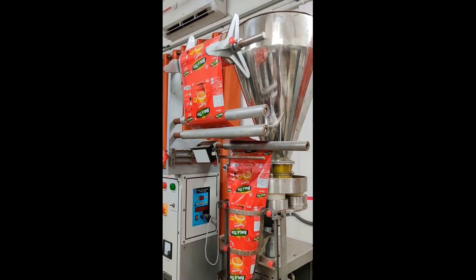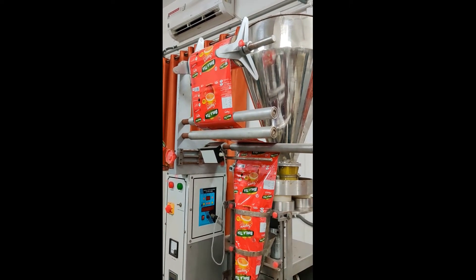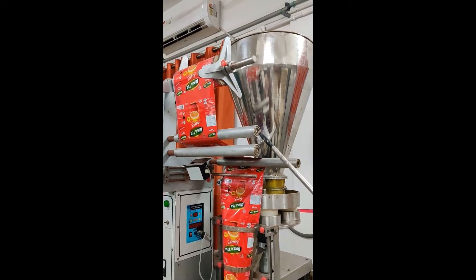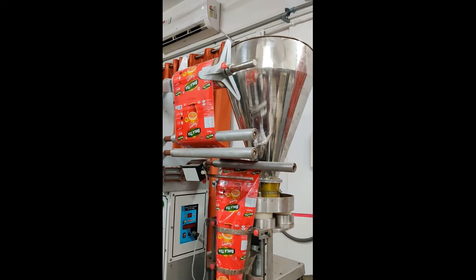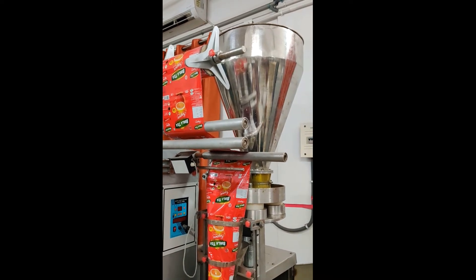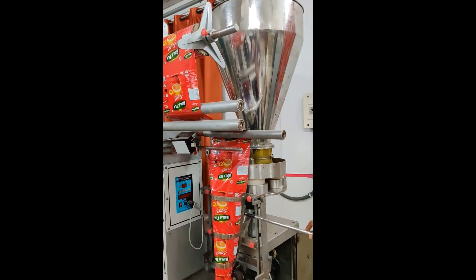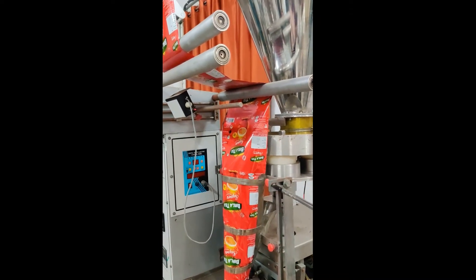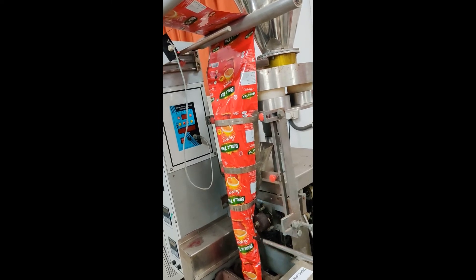The packaging material used here is a bilayer material — a combination of polyethylene and aluminium foil — but it can be modified based on requirements. The next step is the forming of the pouch. This is the forming tube, and the specific part is called the forming shoulder. The packaging material is twisted around the forming tube and pulled along the tube, which enables the next stage of the filling process.